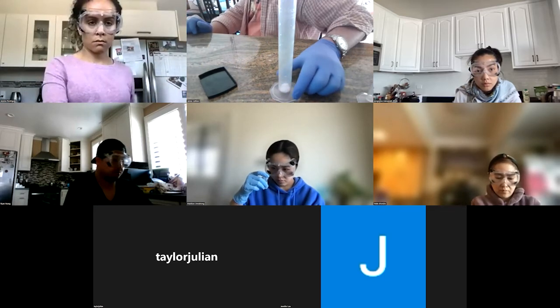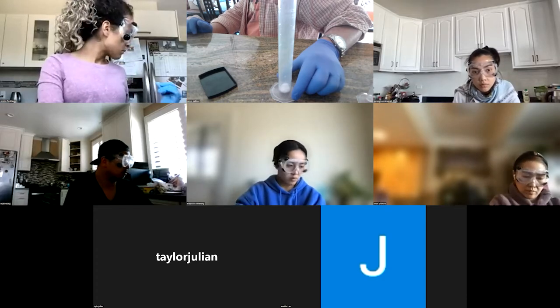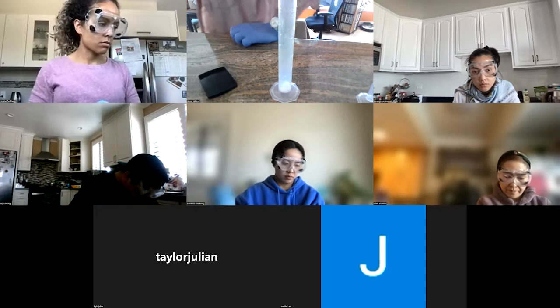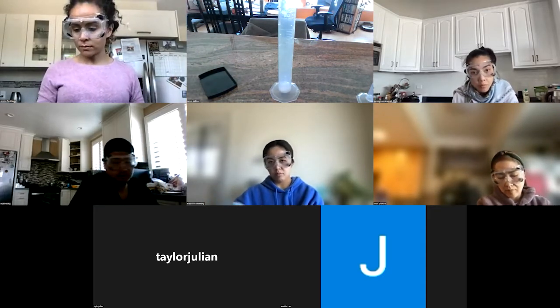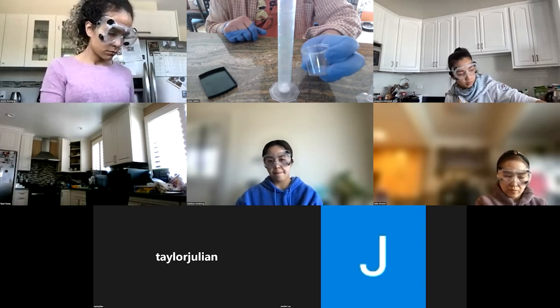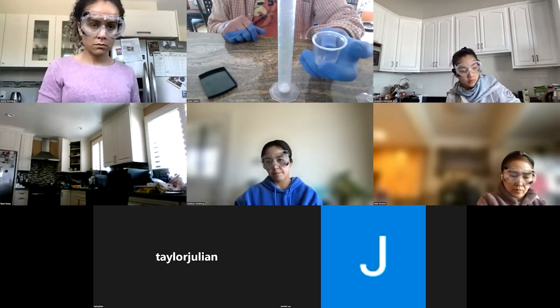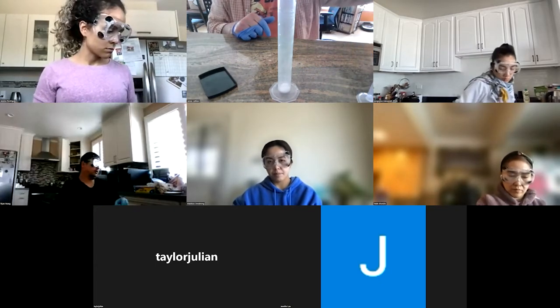I'm not sure what would be good. Maybe one of those small medicine cups, with a cover over it like some tin foil. Then save 25 mils of it for your second experiment for your homemade soap.